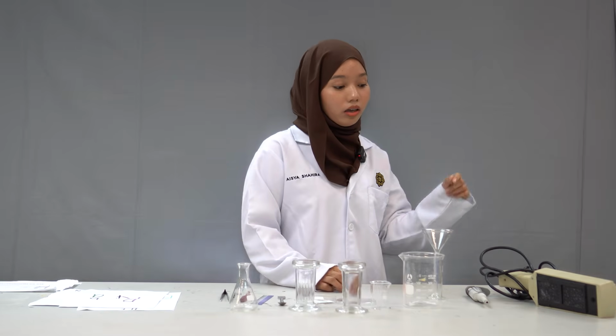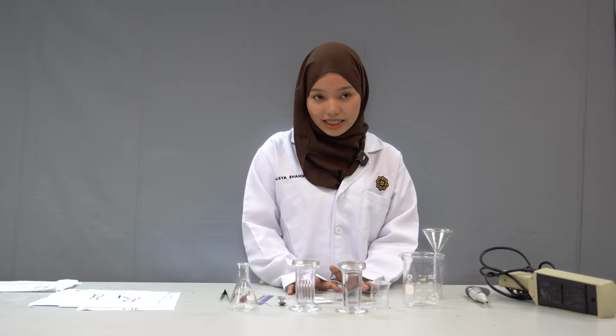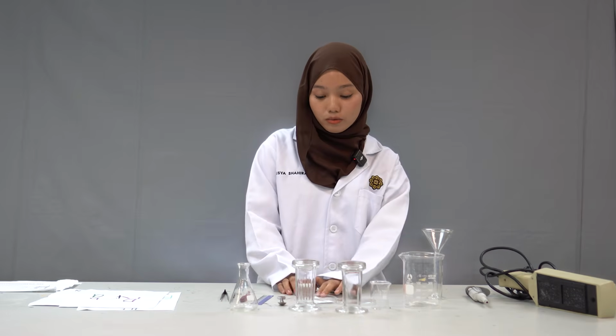When visualizing the spot under the lamp, we cannot look directly into the UV lamp, because intense UV radiation can cause eye irritation and skin redness. So we need to use a transparent UV protective screen made of polycarbonate material.